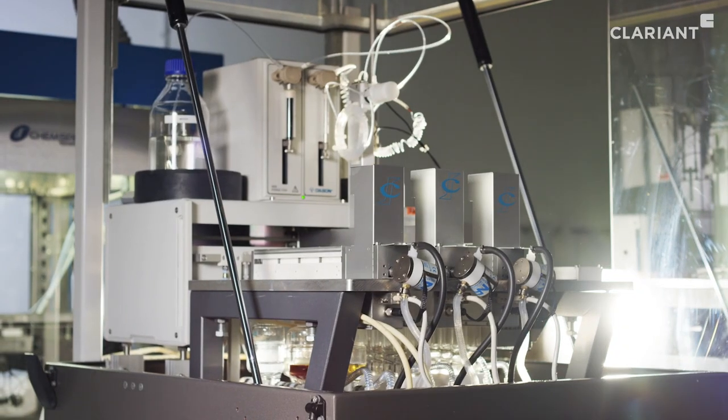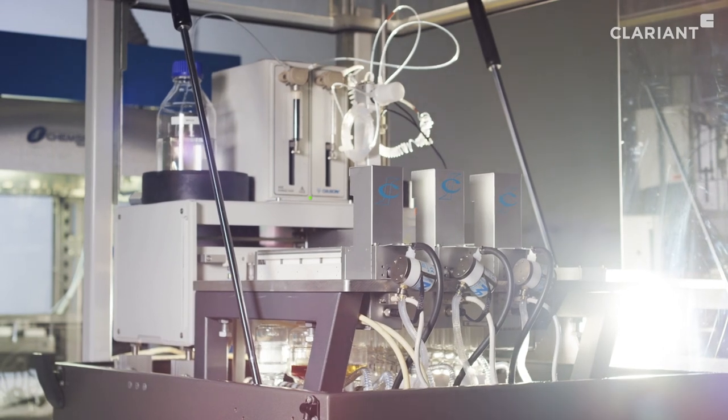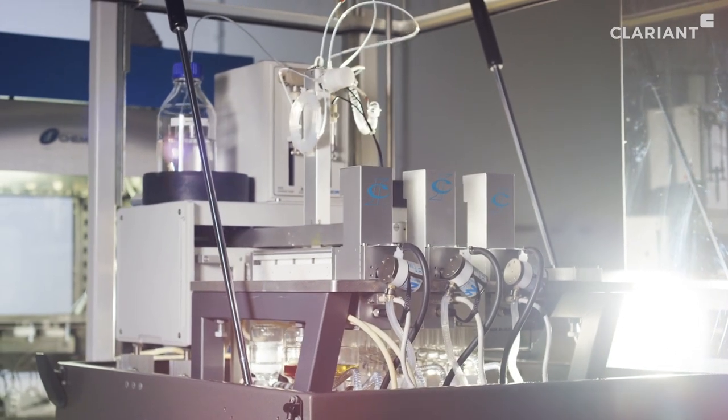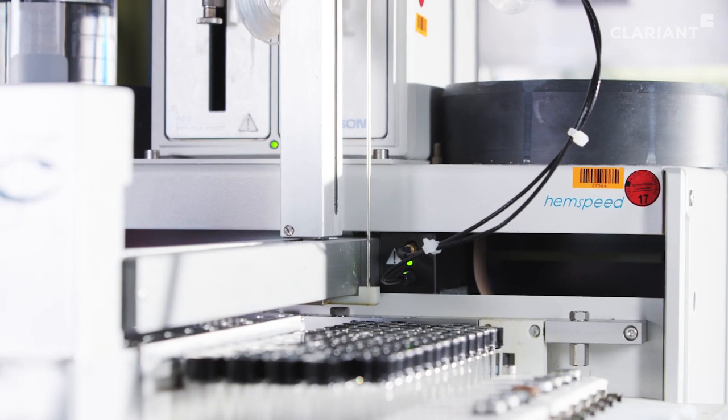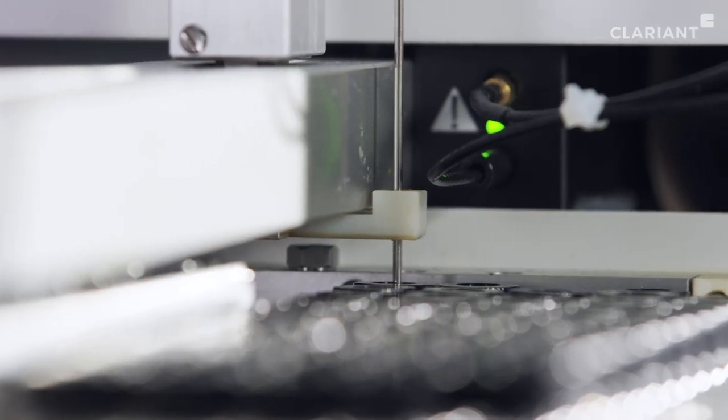On the experimentation side, we have a system capable of executing up to 80 synthesis reactions simultaneously. This system mimics any round-bottom flask chemistry to include workups and purifications.